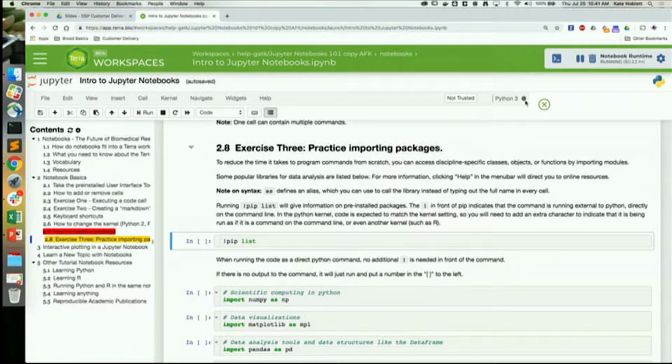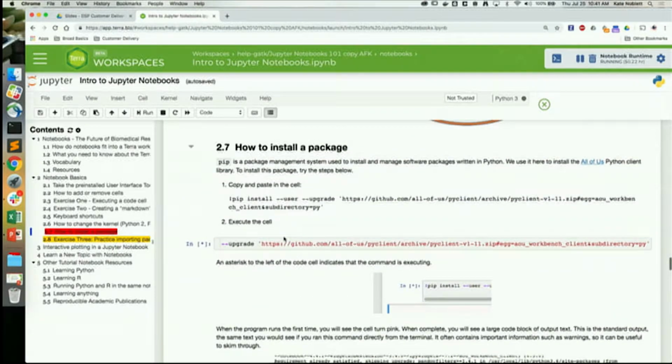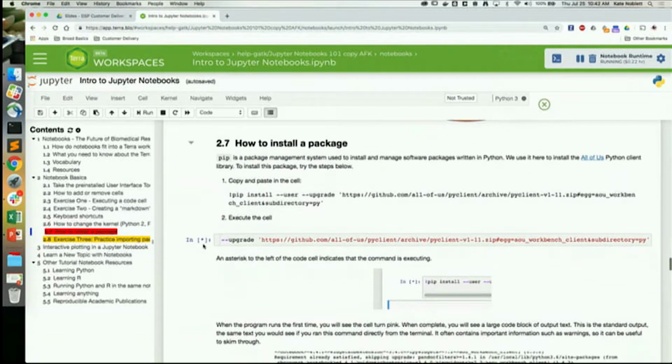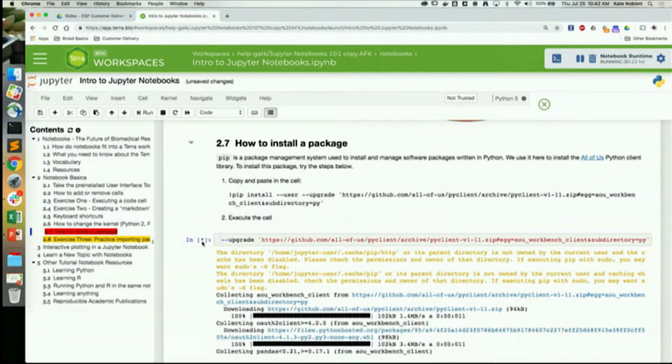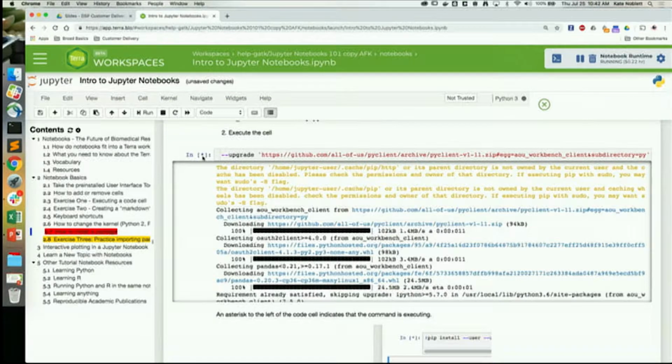So right now, we're loading this package, we're installing this package, and that's taking a while. So you can see here our kernel is busy, and inside of the square brackets, instead of empty space, we now have an asterisk, and the asterisk tells us the same thing that the filled-in circle tells us, which is that it's busy. As soon as it's finished doing that, this will turn into a number, which will correspond, again, to however many cells I have run since the last time I've restarted the kernel. So this was the 4th time that I did that.